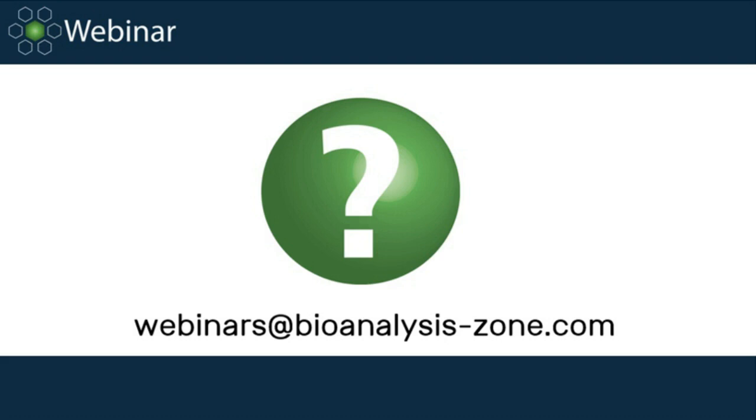Great, thank you. Our next question. The Mitra microsampling is very interesting. Have you experienced any issues with ISR from dried blood matrix? And what sorts of long-term data have you generated in your validated methods?